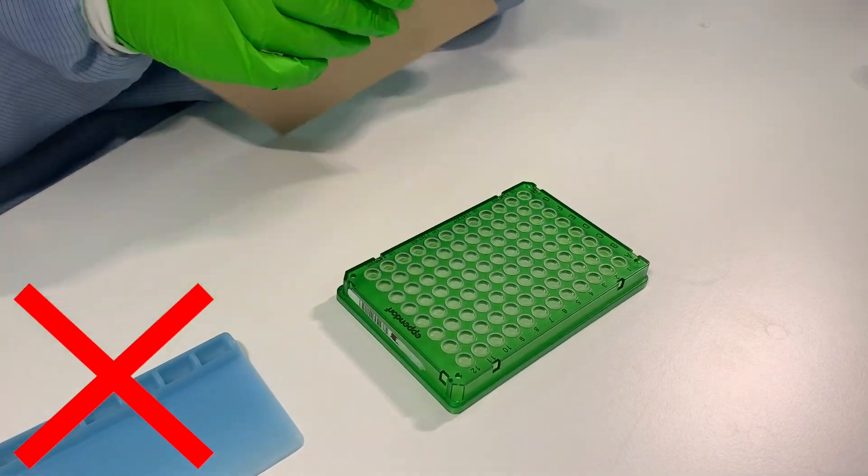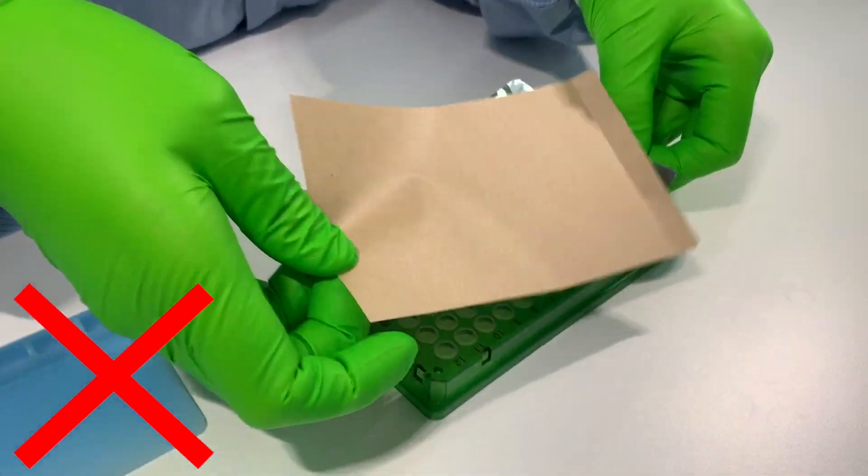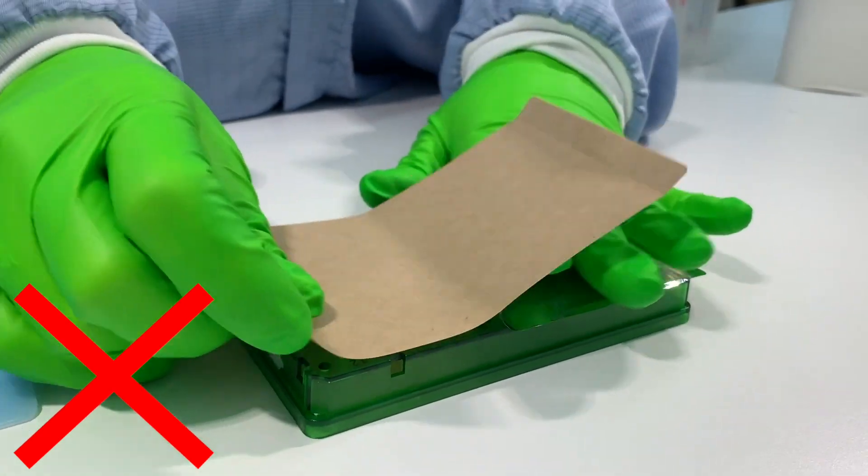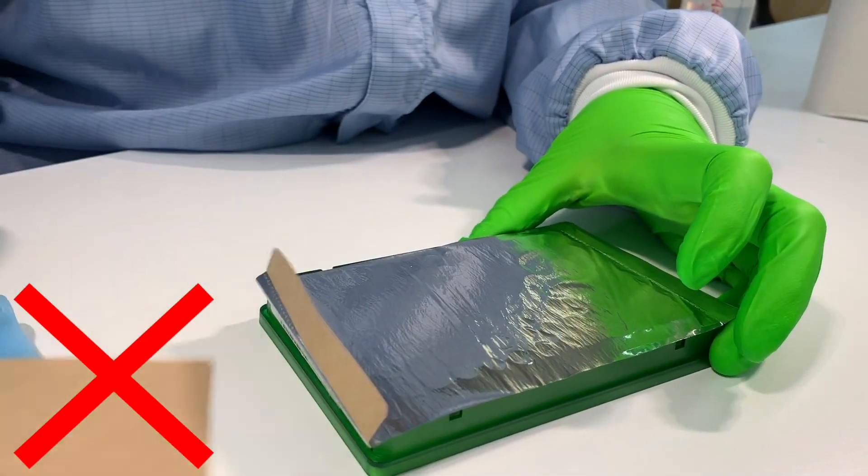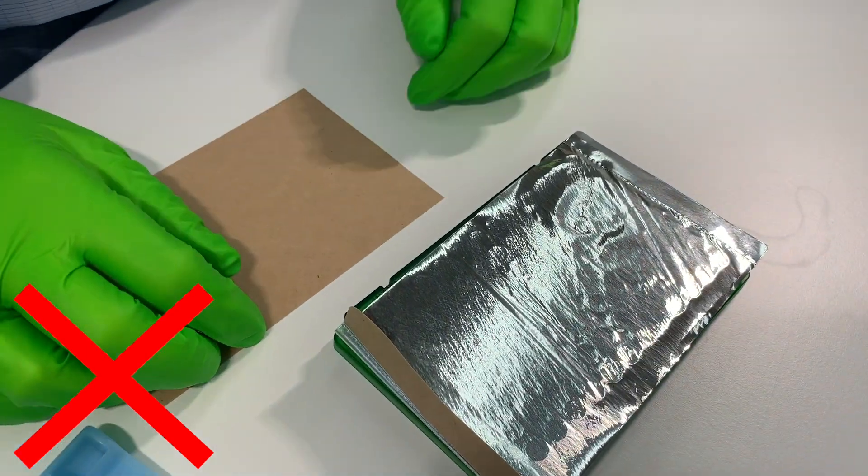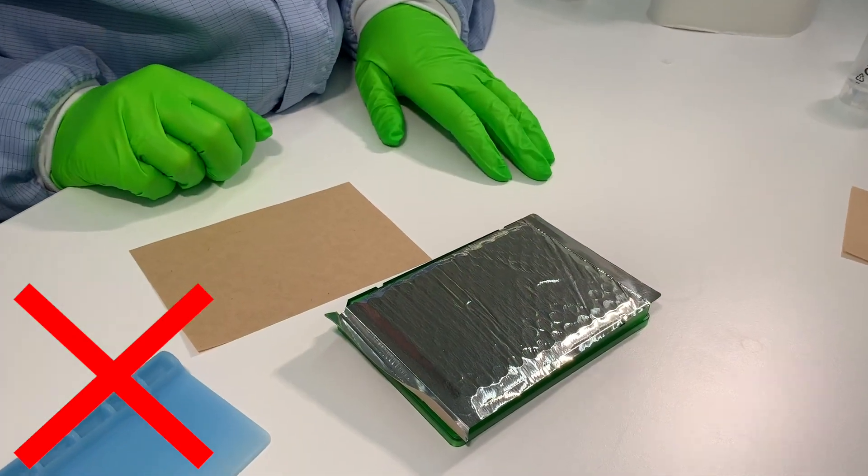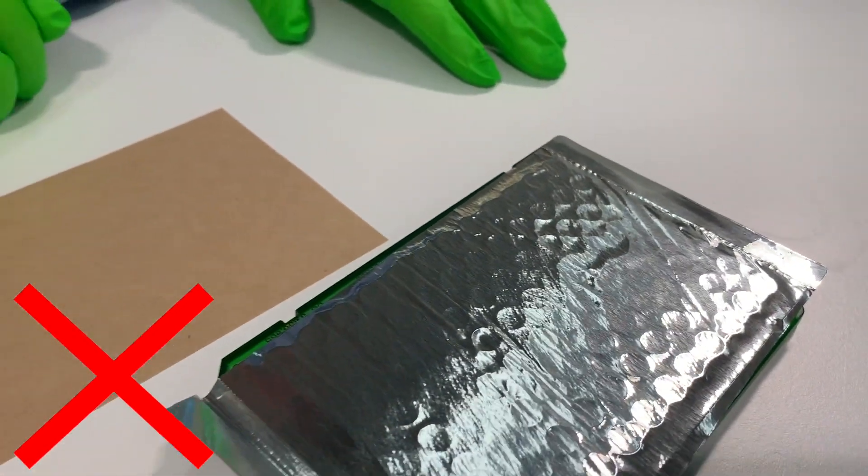Now some common mistakes when following the plate sealing instructions for the first time. In this example, the seal is placed quickly without making sure that it is oriented correctly. The seal sticks to the plate and is then removed and readjusted. This can cause cross-contamination of your samples. Finally, the seal is not pressed down properly. Consequently, you don't see individual wells and there are wrinkles in the aluminum seal.